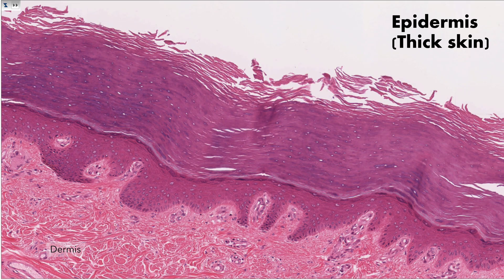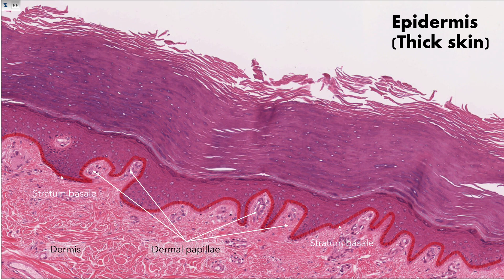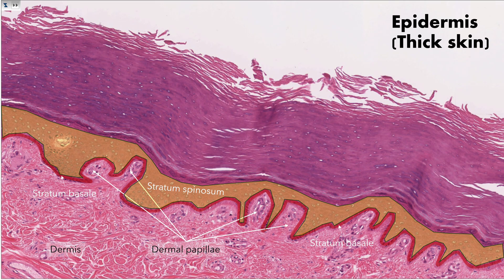Here is a high magnification image of epidermis. The dermis is composed of dense irregular connective tissue. Projecting outward from the dermis are dermal papillae — dome-shaped projections that increase contact between the dermis and the epidermis. Following the contours of the dermal papillae is the deepest layer of the epidermis, the stratum basale. The stratum basale contains a single layer of cuboidal to low columnar shaped cells. Stem cells that produce all of the cells and layers above are found in the stratum basale. The layer above the stratum basale is the stratum spinosum. The stratum spinosum contains live cells and is a variable number of cell layers thick. The cells are described as spiny as they take on unusual shapes to help fill in the space between the stratum basale and the stratum granulosum.